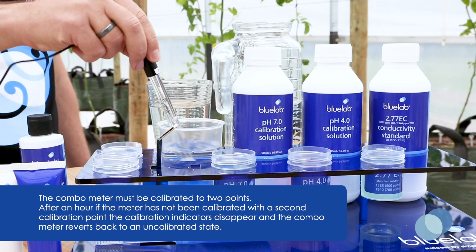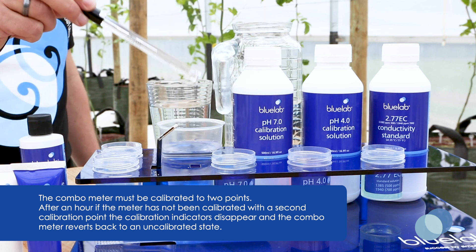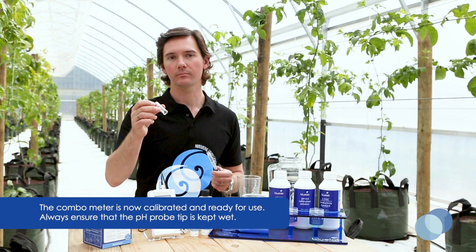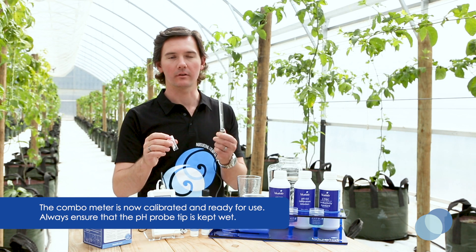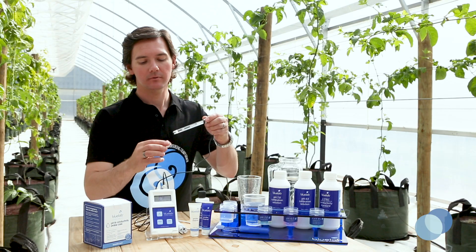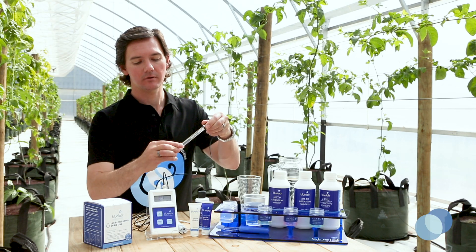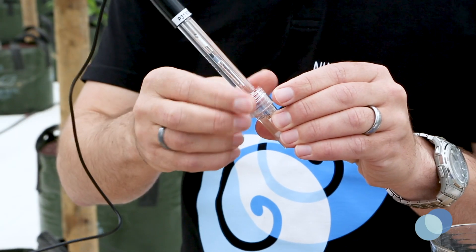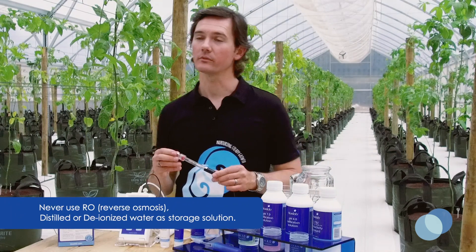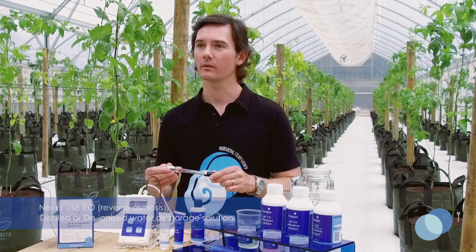Rinse the probe in fresh tap water, and you're all done calibrating the pH probe. Before you put the storage cap back on, make sure you've got enough KCL probe storage solution inside the cap to fully cover the glass probe tip when the probe is inserted. Put it back in the storage cap and turn the top of the storage cap clockwise to tighten. Remember, never store your pH probe in reverse osmosis, distilled, or deionized water, as these types of pure water can change the chemistry of the probe glass and cause damage to your probe.